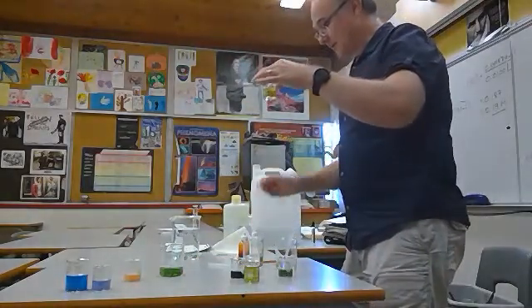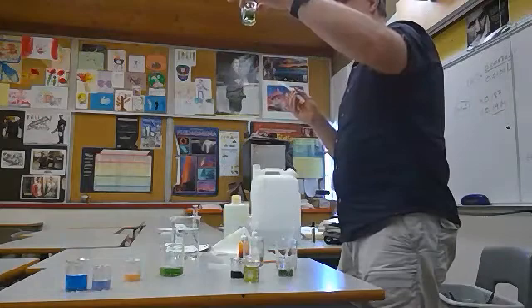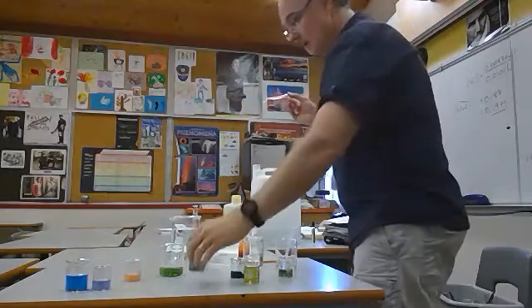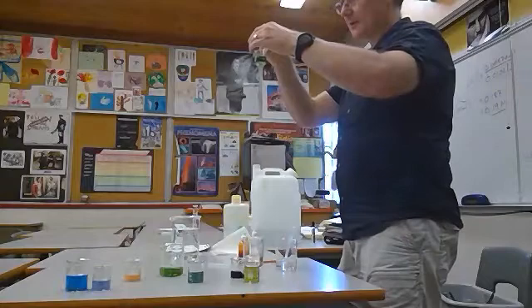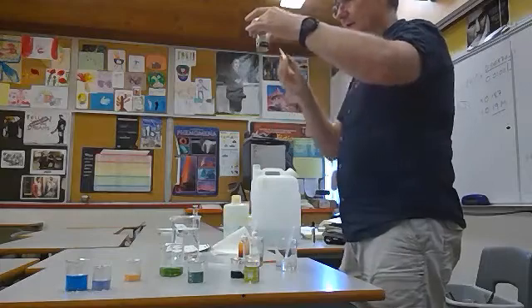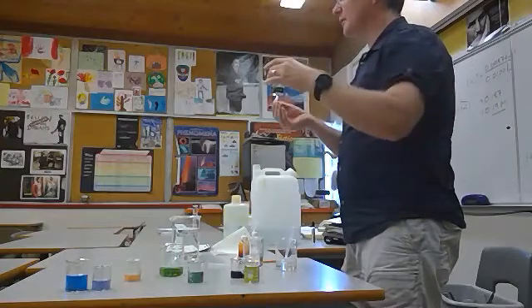So if I take this and add one drop, because there's no buffer in here, you can see just adding a single drop to that changes the pH already from an acid well into the base range of things. But here's my buffer. If I add base, or sorry, add base to this, no change, no change. And I'm adding huge amounts of base to this. So once again, the buffer resists pH changes, but it is going up in pH, it's not very much.